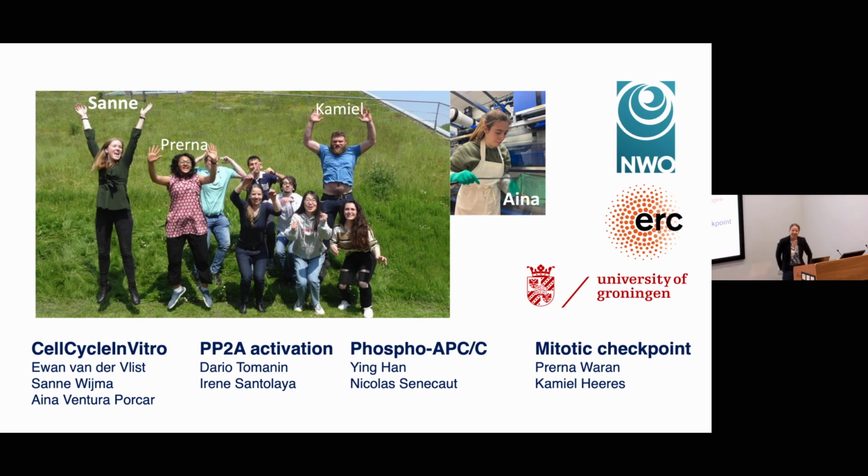So if you vortex too little, the droplets become really big. If you vortex too much, they become really small. So this is kind of the Goldilocks for us. It probably depends on the vortexer. Generally, there are interesting things about having this heterogeneous kind of sizes, but it also makes a lot of trouble.